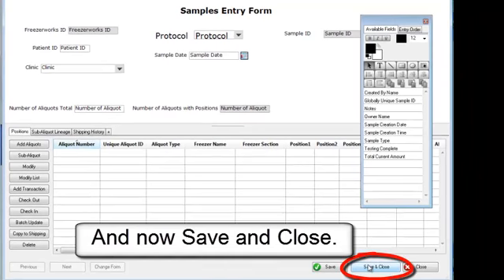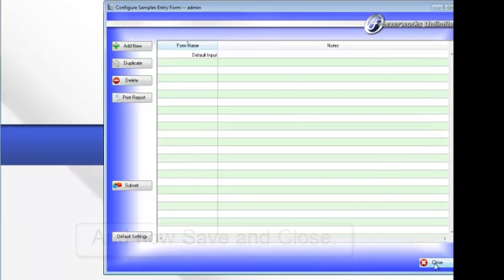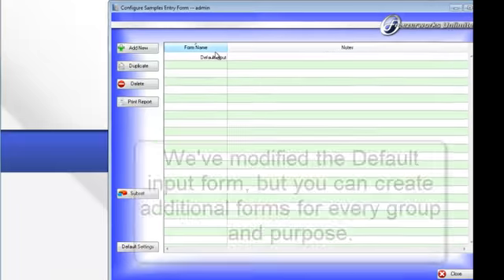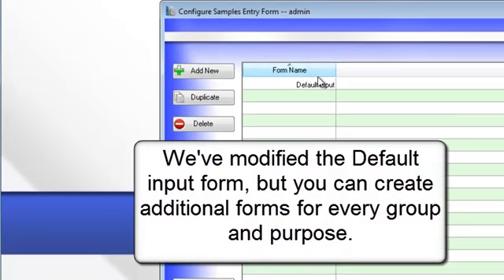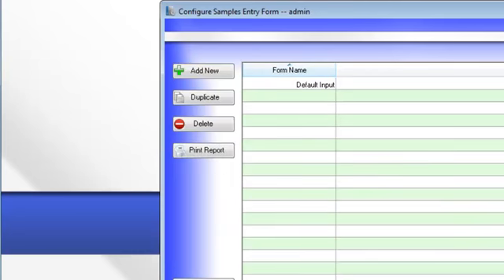And now save and close. We've modified the default input form, but you can create additional forms for every group and purpose.